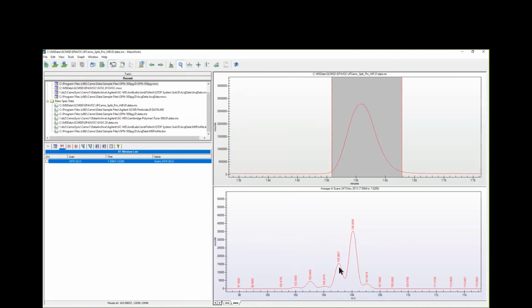Very commonly, what you see in EI fragmentation is you'll see an ion, and then you'll strip off a proton, and you'll see the loss of a hydrogen. And the problem here is obviously that has an isotope pattern that goes like that. It will actually interfere with the molecular ion, or this can obviously happen with fragment ions here.